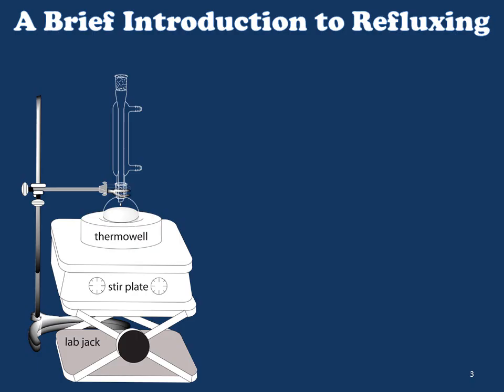One solution to this problem is to use a reflux condenser. The apparatus shown consists of a lab jack with adequate clearance, holding a stir plate underneath a thermowell, so that when the lab jack is lowered, the heat source will be removed. This apparatus also includes a boiling flask clamped in place, and a reflux condenser, also usually secured with a second clamp. Importantly, the top of the reflux condenser is open to the atmosphere to prevent pressurizing when we heat the system — closing the top with a stopper or other device would risk an explosion or flash boiling event, causing potential damage and possibly injury.